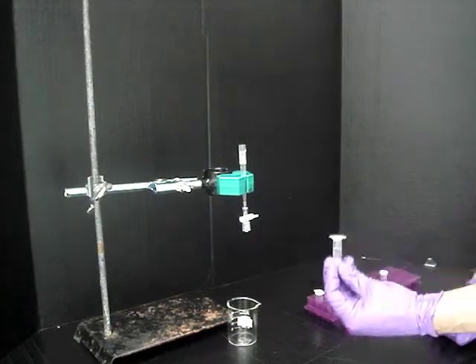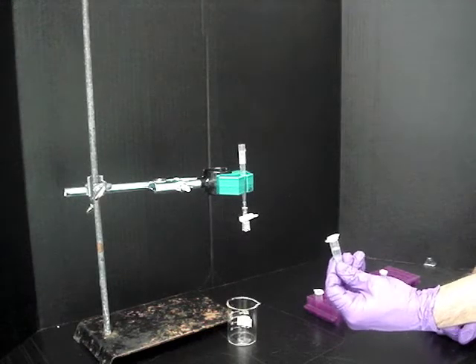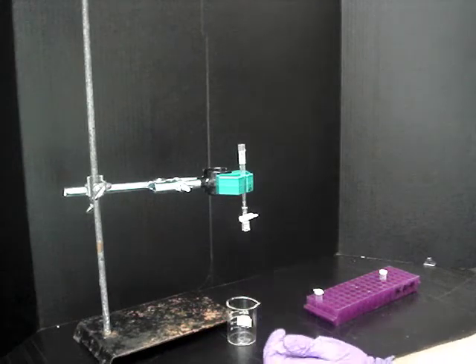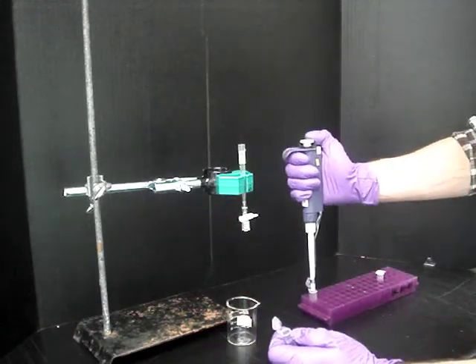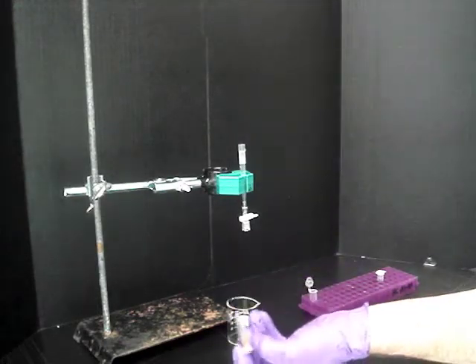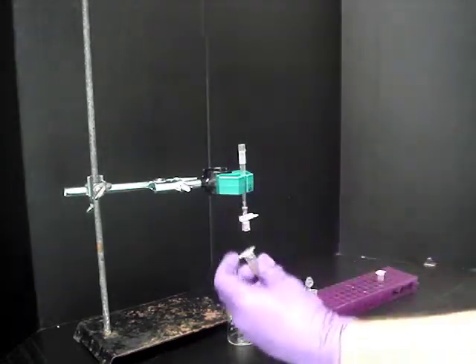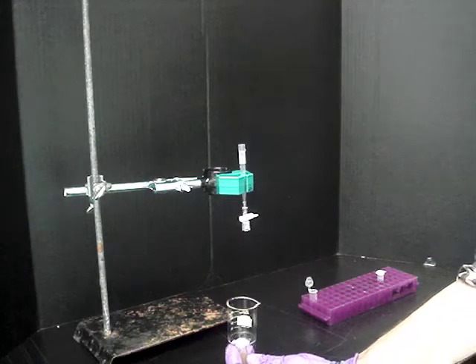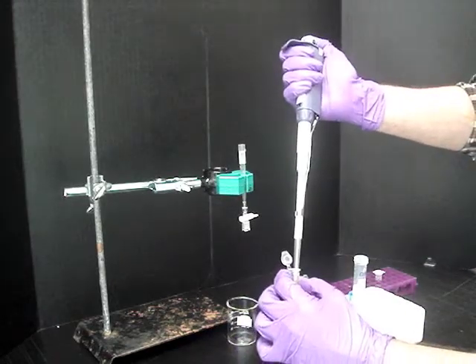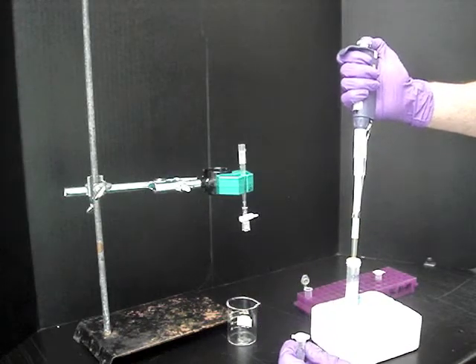We begin the procedure by making a crude nuclei preparation from our transgenic organism in which a cell type of interest has affinity tagged nuclei. We make this extract in a small volume to which we add magnetic streptavidin-coated beads to allow them to bind to the labeled nuclei. We then mix this solution for half an hour in the cold room to allow the beads to bind to the nuclei. After this, we increase the volume to get better separation between the bound nuclei and other particles in the mixture, which allows for a more efficient purification.